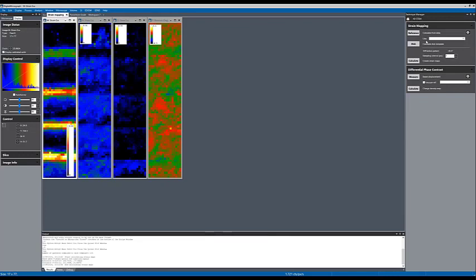Okay, thank you. I have a similar question. Can you talk a little bit about how you chose and designed your sample? So how do you select to make sure there's a strained region and an unstrained region, thinking about thickness, choice of sample? Can you comment on those parameters? Okay, so the sample cannot be too thick, obviously. If it is too thin, then you get strain relaxation, stress relaxation, so you will not be able to detect much.